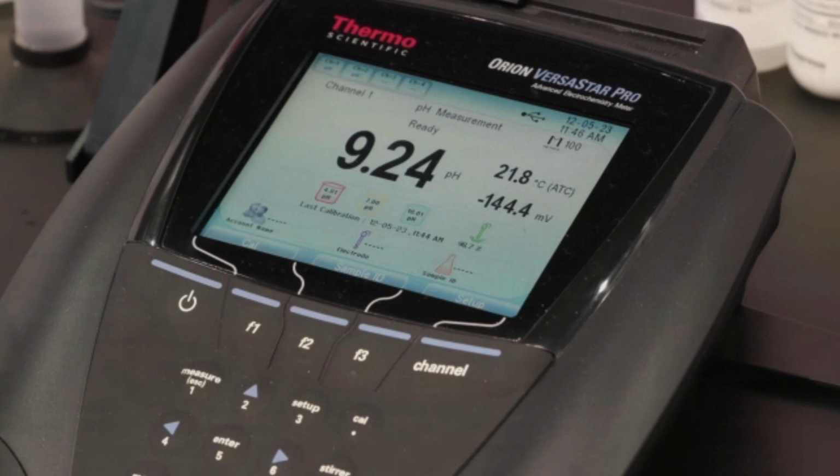In general, we would like our pH to be plus or minus 0.05 pH of the expected value at the measured temperature, or at least plus or minus 0.1 pH. And you should consult your QA protocols to find the particular criteria associated with your work.